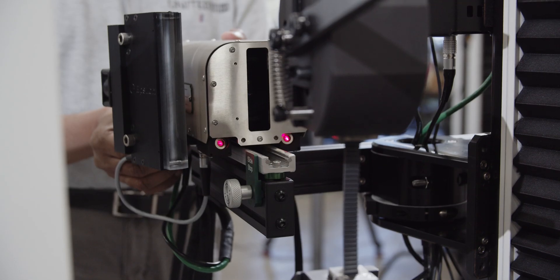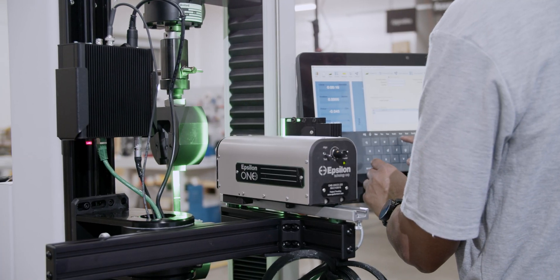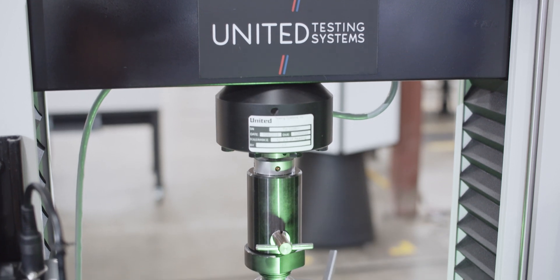The EP1's electronics, combined with United's Datum 5i materials testing software package, gives our customers a complete, highly accurate, non-contact strain measurement system.